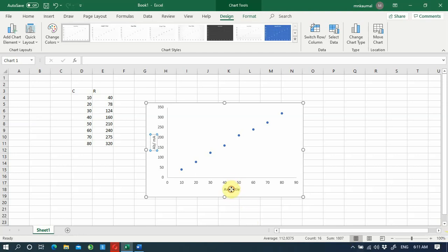And this axis is the concentration axis, so you can write concentration, and you need to write the unit. Unit can be mole per decimeter cubed, or it can be any unit. So you need to really write the unit here. That's important when you label axes. Then let's write dm cube.